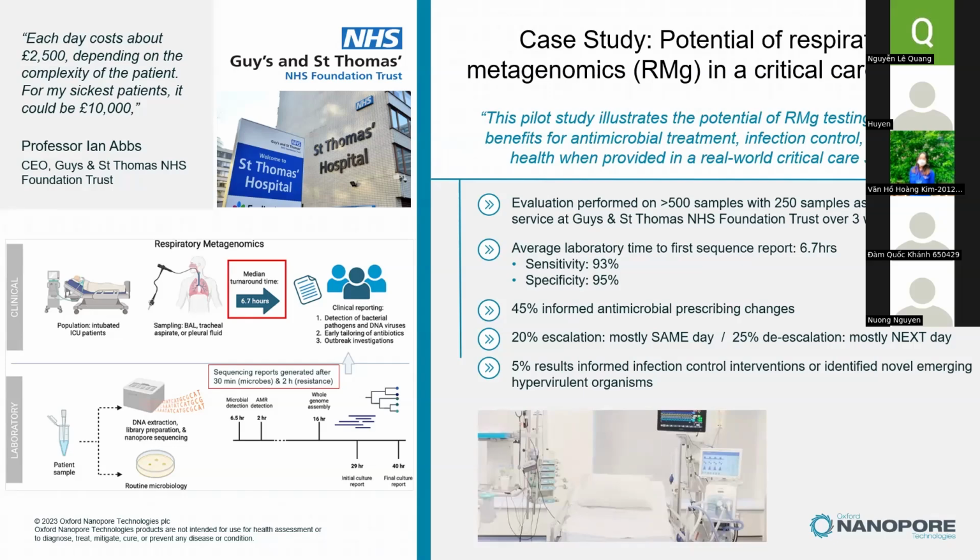I think for microbiomes, it depends on the sample type, like whether it is from soil, stool, or other types of microbiome. One of the challenges remains extracting high quality genetic material from all these samples, so you may need to try different extraction protocols.